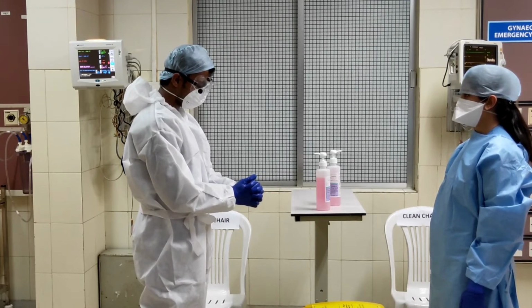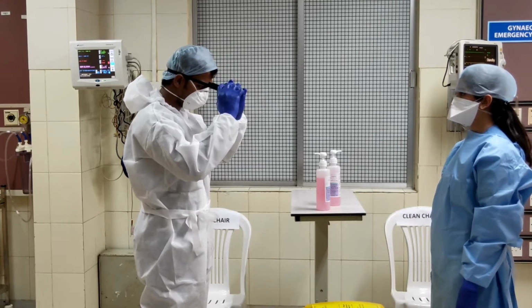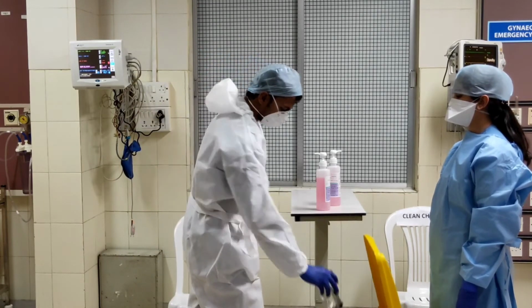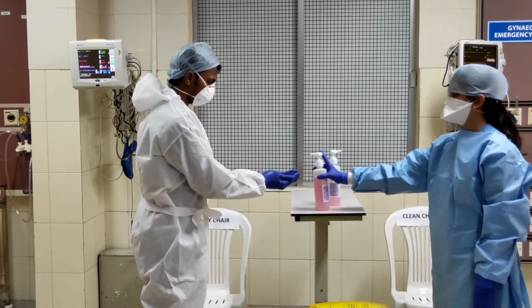Now you can remove your splash resistant goggles from the head. For removing, pull the goggles forward and slowly pull it backwards over the head and discard the goggles. Again, disinfect your hand.